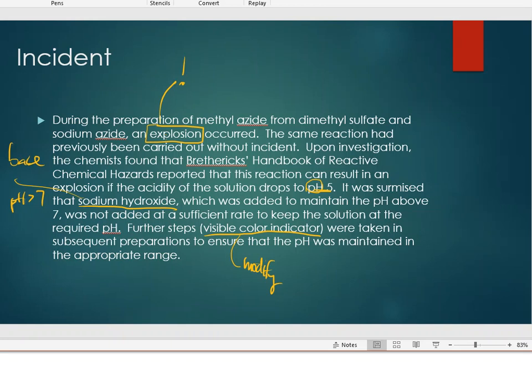That's what's happened. And just because it's written down in an SOP, just because it's been done over and over the same way every single time without incident, does not matter. It does not matter. Because at any point in time, something weird and wonky can happen to you in a laboratory, and you've got to be prepared for it, right? And that's hopefully what this class will allow you to think about and allow you to do.